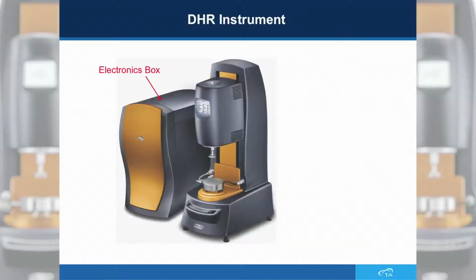Each DHR is a two-component system. There is an instrument and a standalone electronics box. The electronics box contains the power supply and handles communication with the computer. The on-off switch for the unit is located on the back panel of the electronics box.